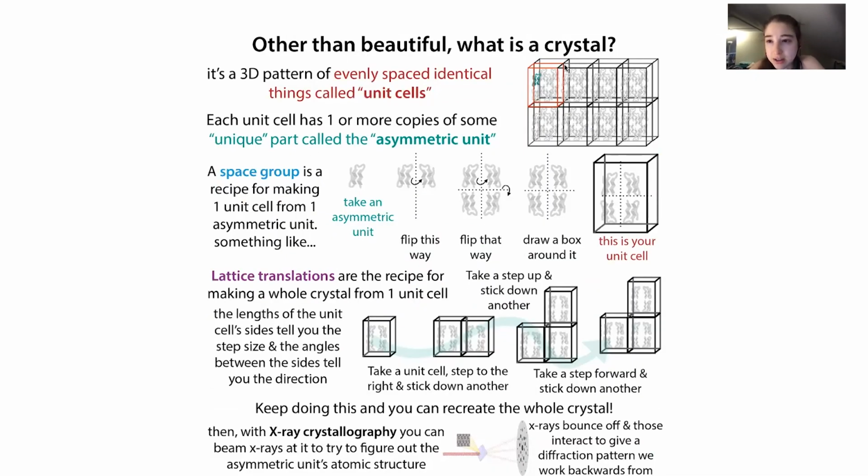But you can imagine if one of these molecules was slightly off, you could get regions of the crystal where you have a slightly different lattice, so part of it's like this and part of it's like that. Any of those things are going to blur up the data. Remember that our resolution is coming from all of the molecules contributing. So you can have defects in your crystals that can help lower the resolution, make it worse.